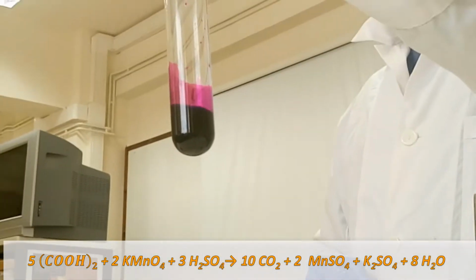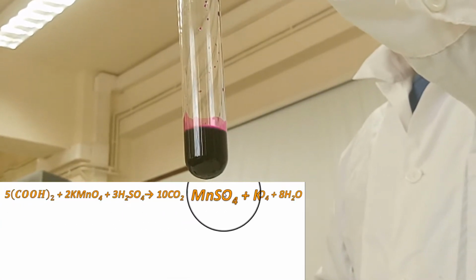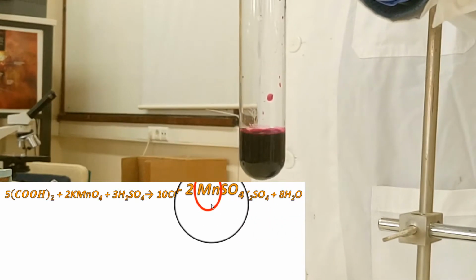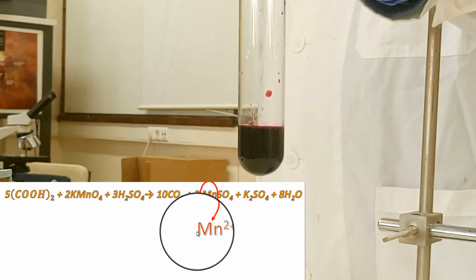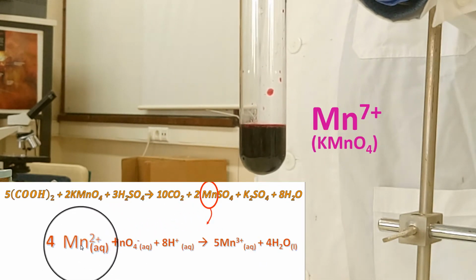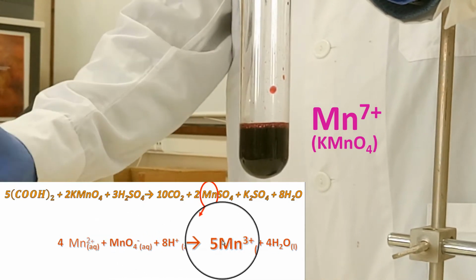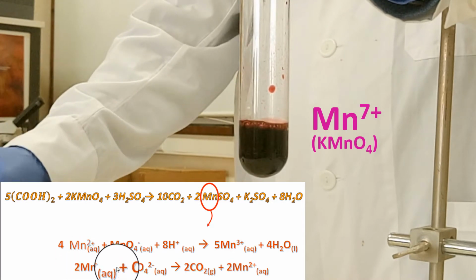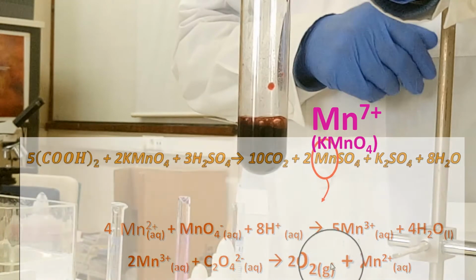Oxalic acid reacts with permanganate ions in acidic conditions in an oxidation-reduction reaction to carbon dioxide and manganese sulfate. The bivalent manganese produced speeds the reaction itself, a process called autocatalysis. Bivalent manganese formed reacts with permanganate to produce manganese 3, which in turn, and as a reaction intermediate, reacts rapidly with oxalic acid to yield carbon dioxide and to regenerate the manganese 2.